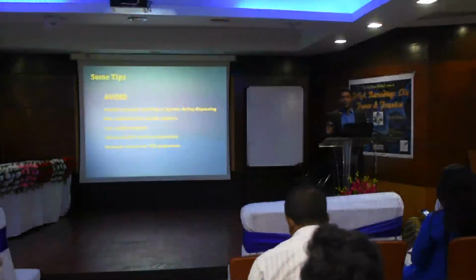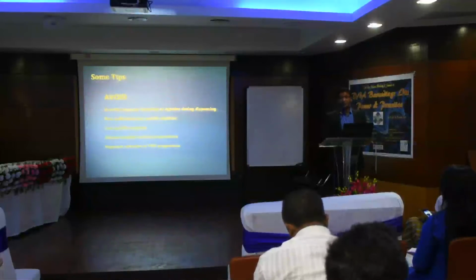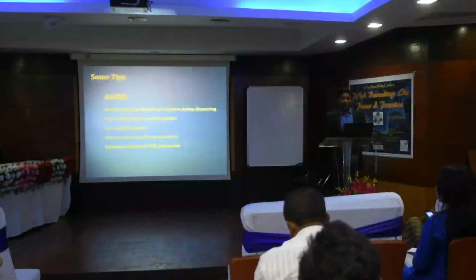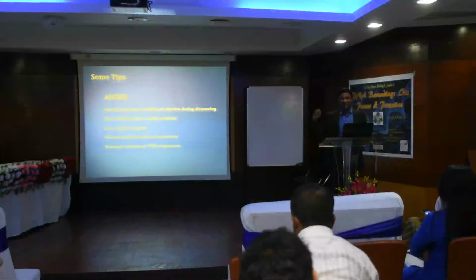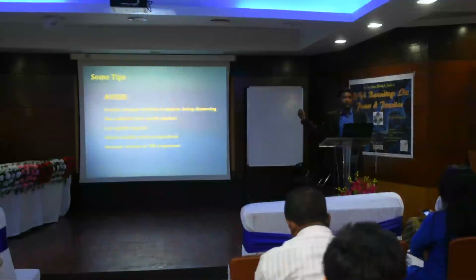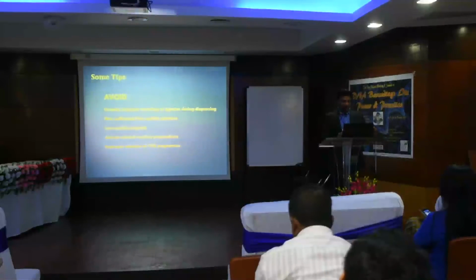So when you are doing assessment, you can be a master of your own, you can be your own guide. Whether the sequencing company is cheating you or doing it perfectly, you can judge based on this. But for that, unfortunately, you require original software, which costs more than 12 lakh rupees to see all this. But there are some software also available. Even your quote-unquote aligner will give the opportunity. It will not show you the third window, but it will show 2 windows. That is good.